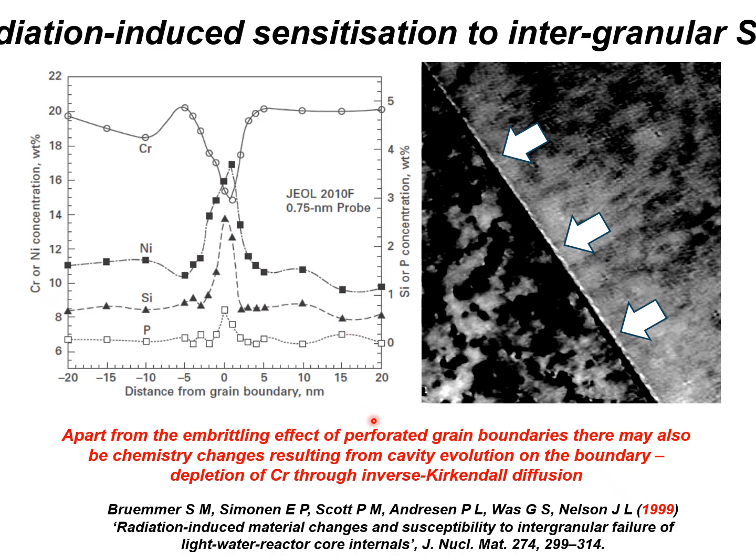Anyway, I'm just saying that it's really off the top of my head. I'm being a little bit glib about it. It's kind of what I think is going on, but I can't prove that because I don't have the samples and I can't verify it. But it seems to me that that's something that should have been looked into, or can be looked into in future.